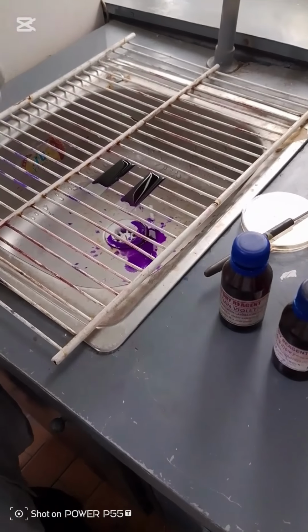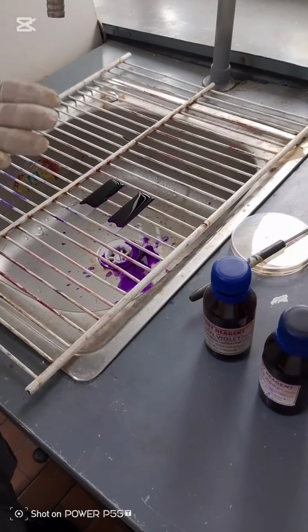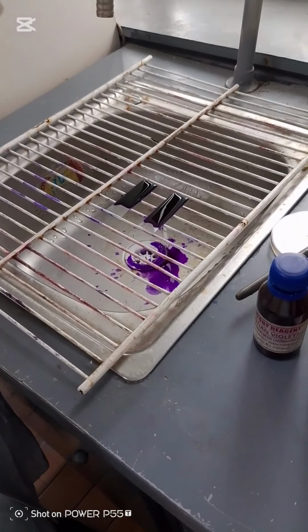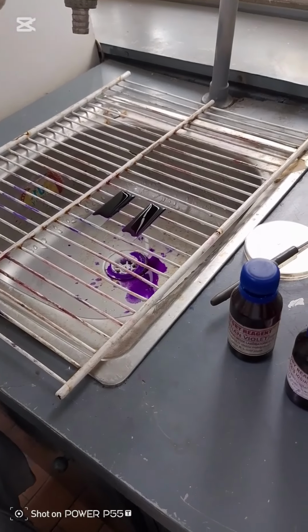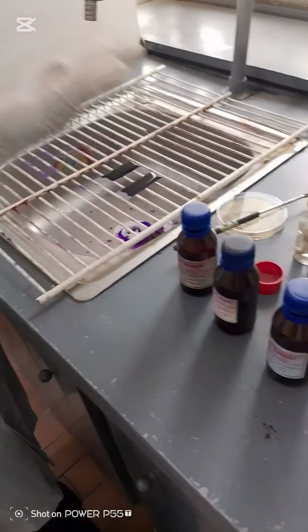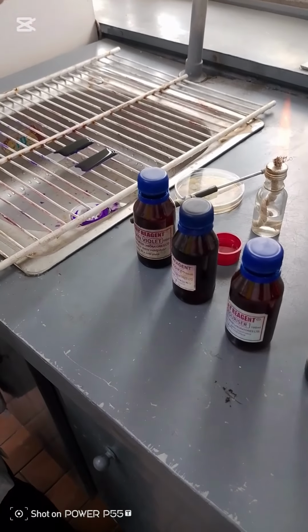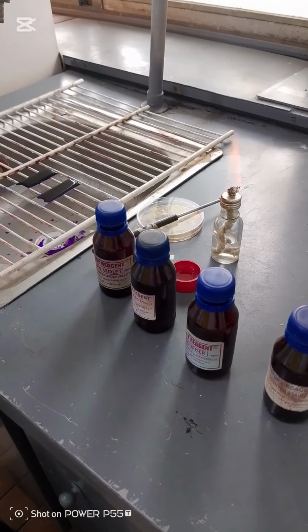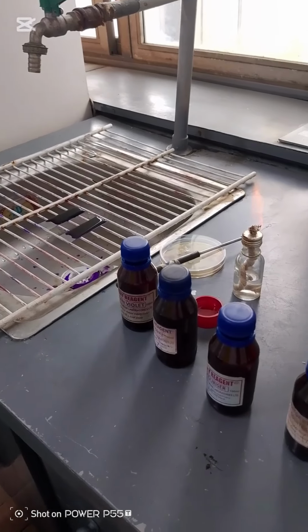Actually, what we are staining in gram staining is the bacterial cell wall. It's the cell wall we are staining in the bacteria. And the bacterial cell wall is made majorly of peptidoglycan and other structures. For gram-positive bacteria, you have majorly peptidoglycan structure, more than 70% of the cell wall. For gram-negative bacteria, less than 10% of the cell wall is made up of peptidoglycan.